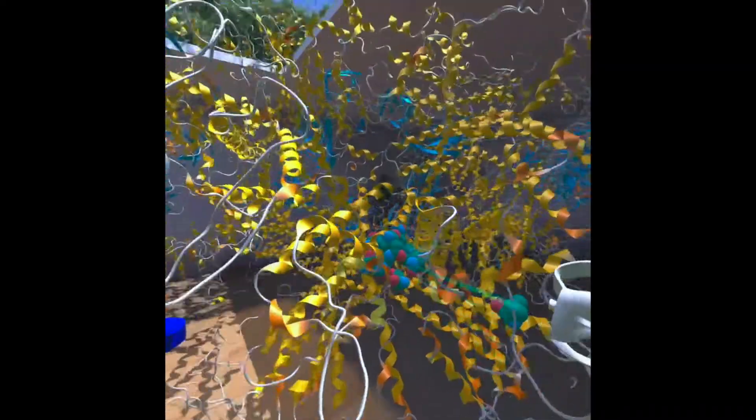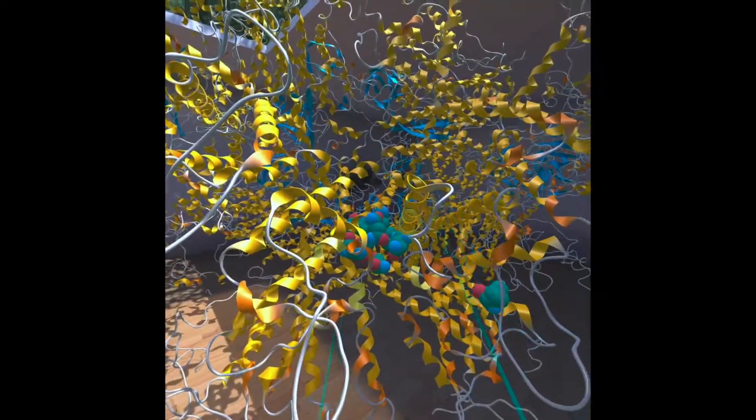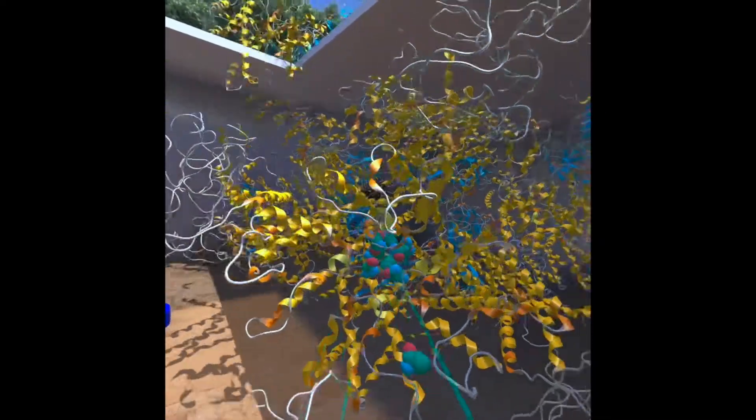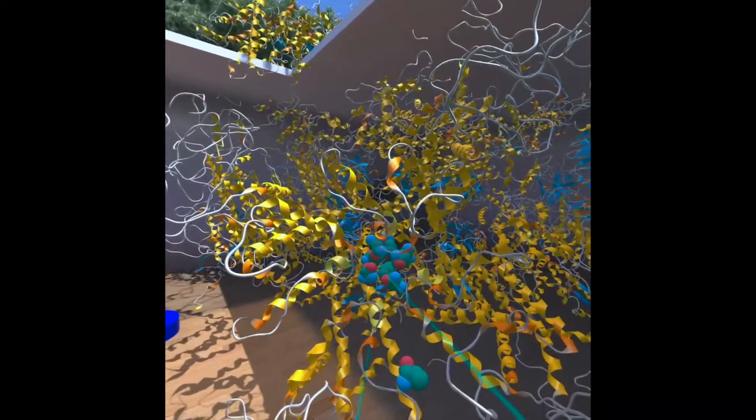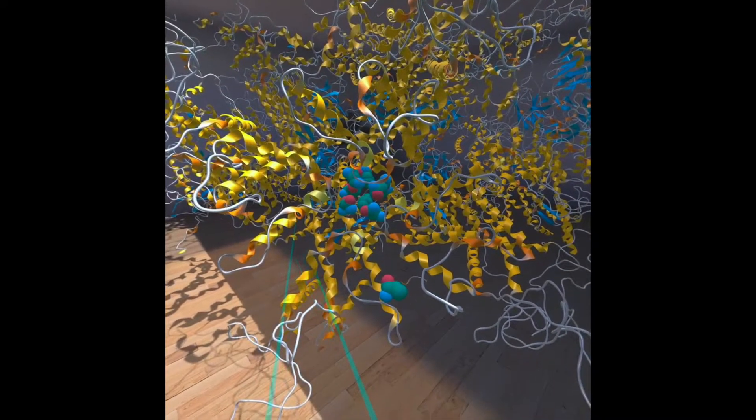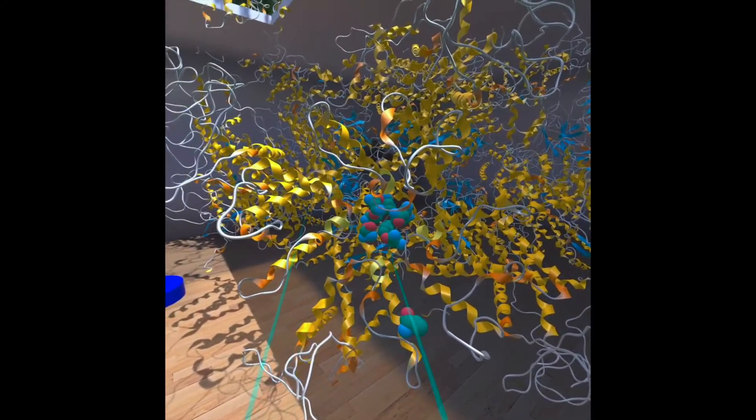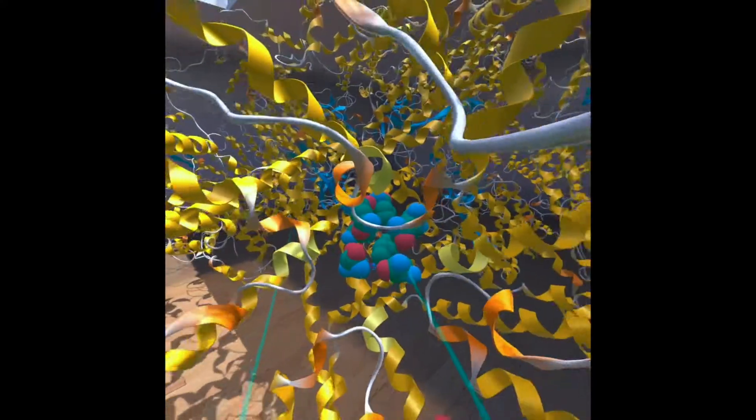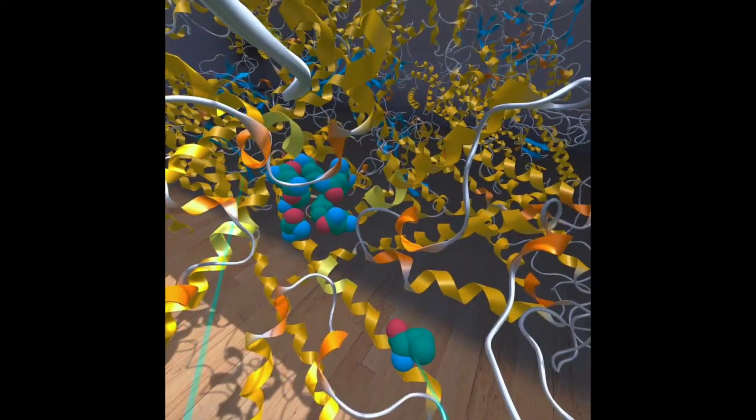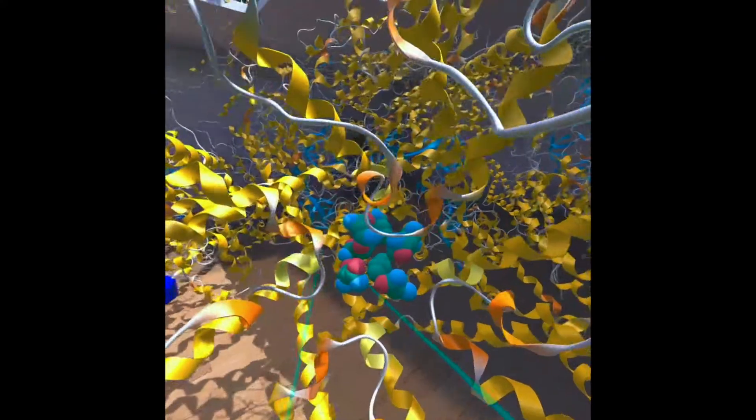And now we can nicely see here in the cartoon the residues that are making up, and we have a second one we shouldn't have selected.